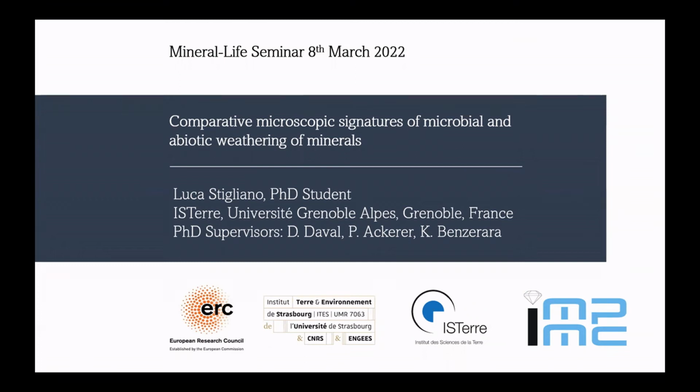Today I will talk about my PhD project, which is on mineral weathering in presence and absence of microbes. More specifically, it will be about the dissolution morphology in abiotic and biotic conditions. And I will try to propose some statistical techniques to possibly distinguish between one and the other based on surface microtopography.